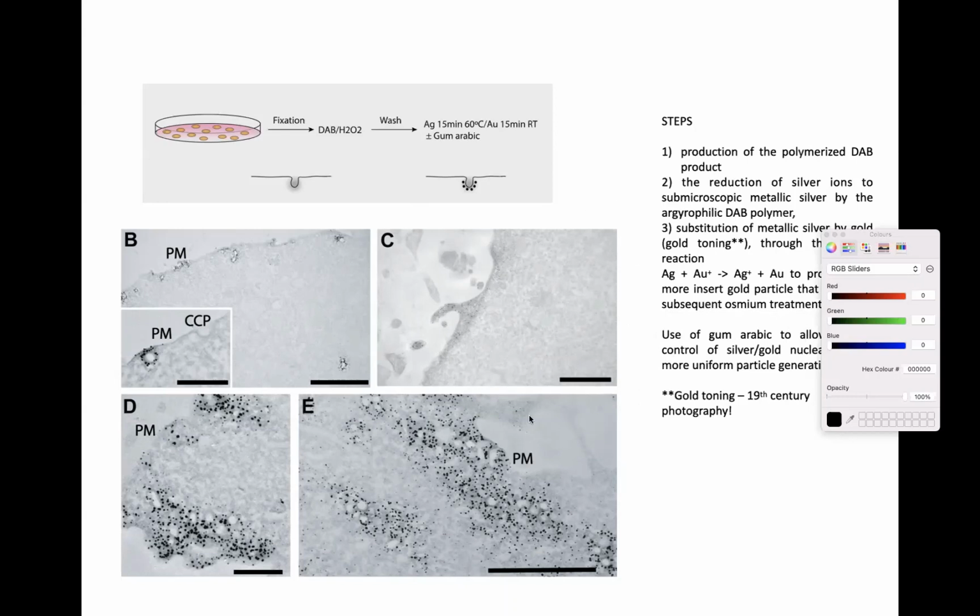And you can see that the particles produced are very clear. The signal noise is great. We can do thresholding. We can use automated analysis because it's good enough for these techniques with machine learning.